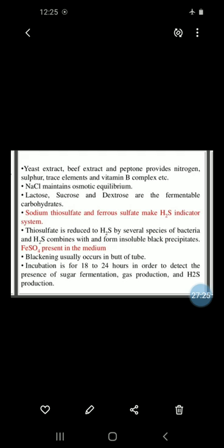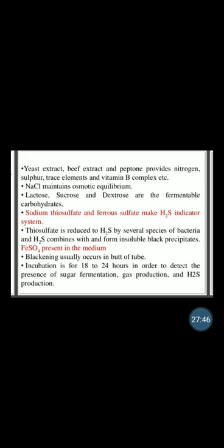Next, the yeast extract, beef extract and peptone provide nitrogen, sulfur, traces of elements and vitamin B complex. Sodium chloride maintains the osmotic equilibrium. Lactose, sucrose and dextrose are the fermentable carbohydrates.